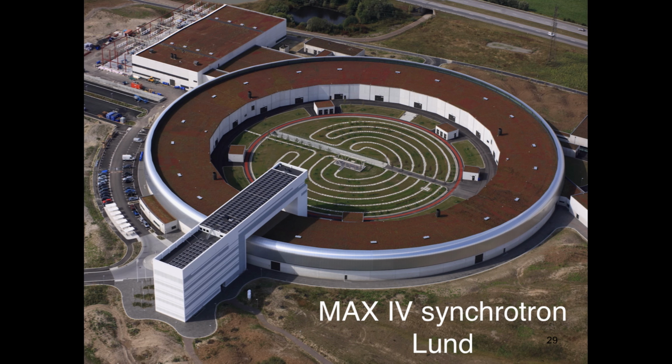Okay, once you get your crystals into the loops and into the liquid nitrogen, we pack them into shipping dewars and send them off to a synchrotron, where we use the X-ray beam. And in this particular picture, I'm showing you the synchrotron at MAX IV, which is located in Lund, Sweden.